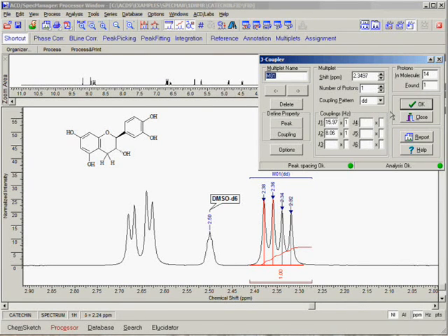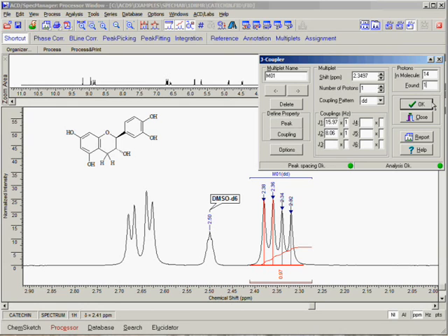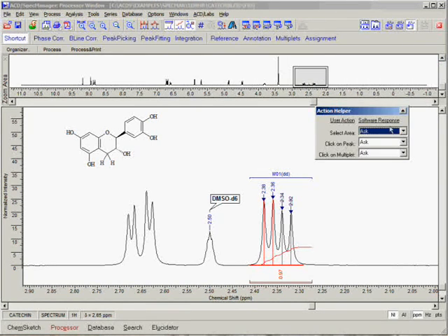Please note that we have already attached a structure to this spectrum. By doing so, the software is normalizing the total integral of the spectrum to the number of protons on the structure. You can see that here in the J-Coupler dialog. If we are satisfied with the results, we can click OK and proceed to the next multiplet.